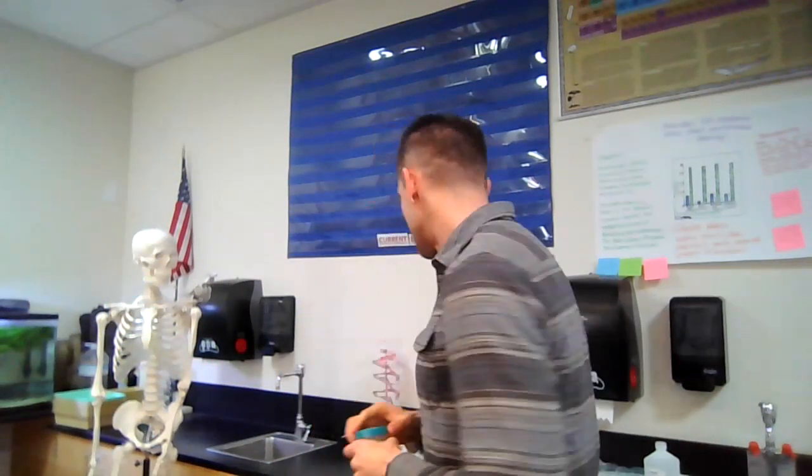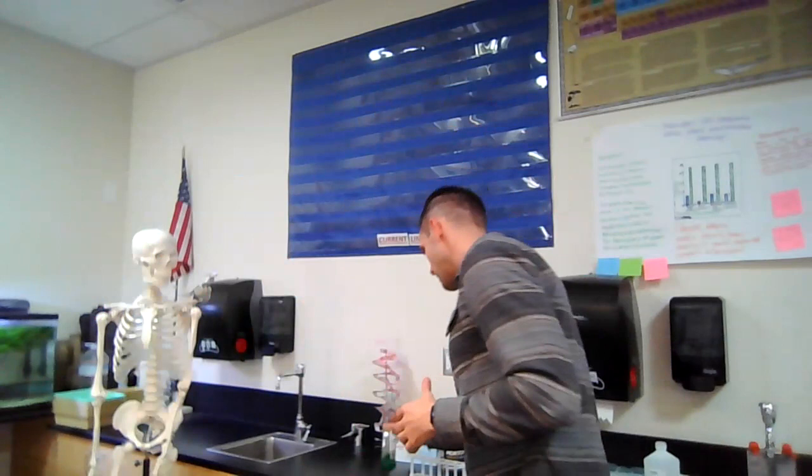All right, this extraction buffer is 3 things. It's got water. It's got dish soap, just a couple drops of any kind of dish soap that you might use at home. The dish soap is there because it makes things slippery. And DNA is in the nucleus of the cell. It's kind of like the core, the pit of the cell almost.